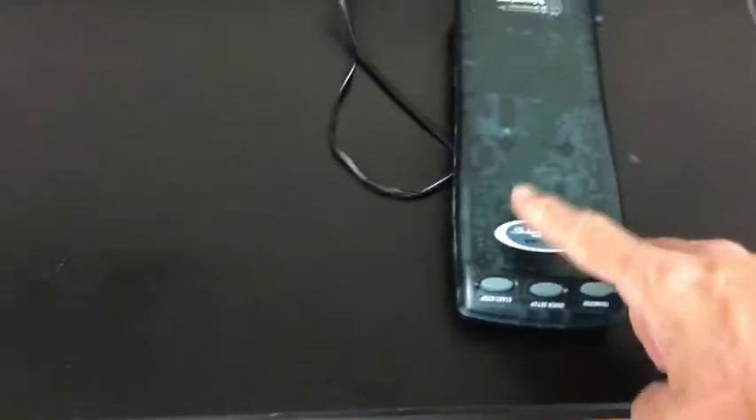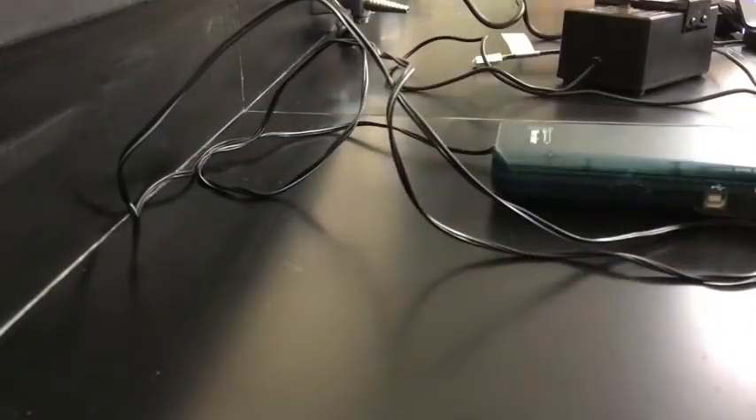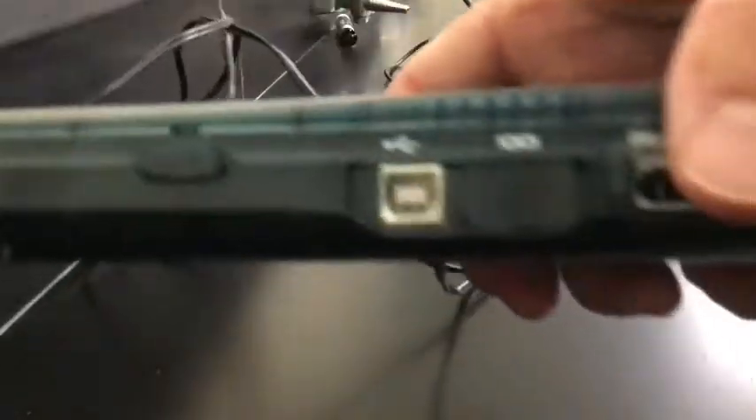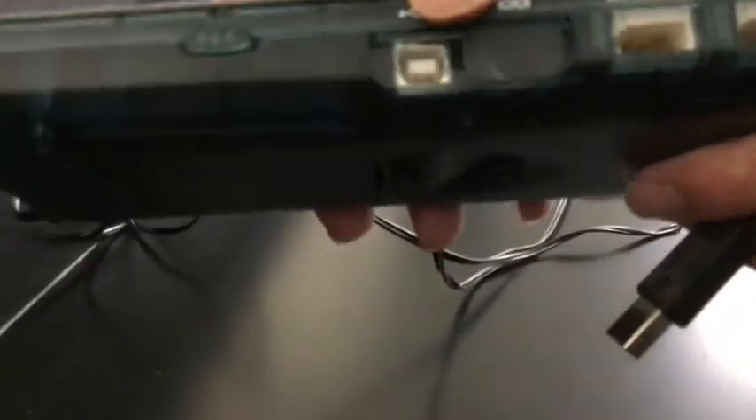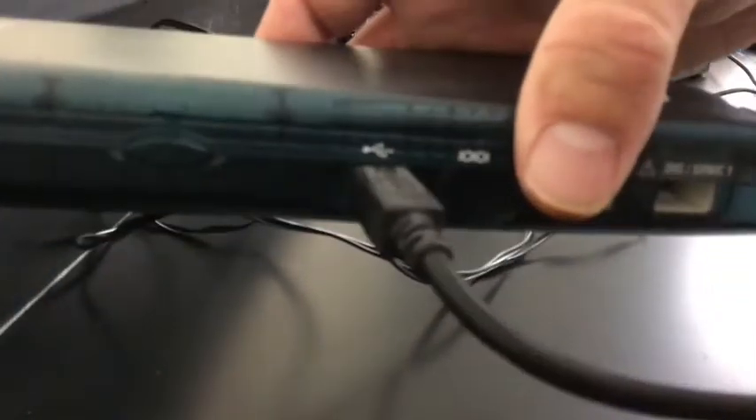Now we're going to connect this green box here to the computer. We're going to take this cable and look for the square end. The square end is going to go into the square port on the green box. If it's not visible, it might be slid over. It's got the little USB symbol and that square shape, so just put that end right in there.